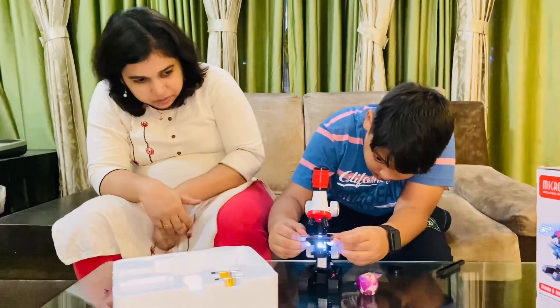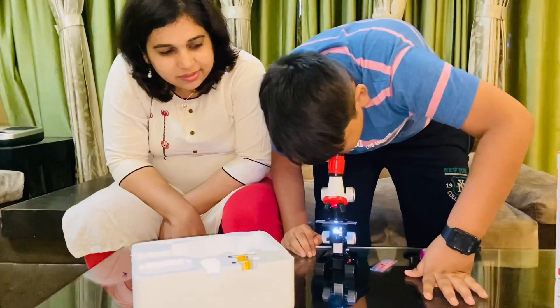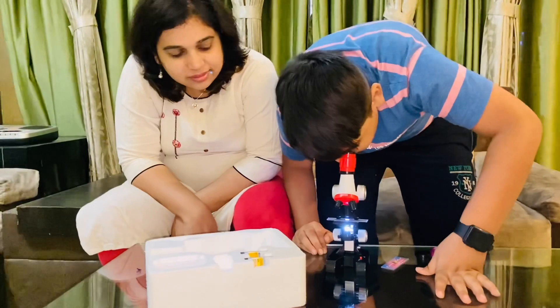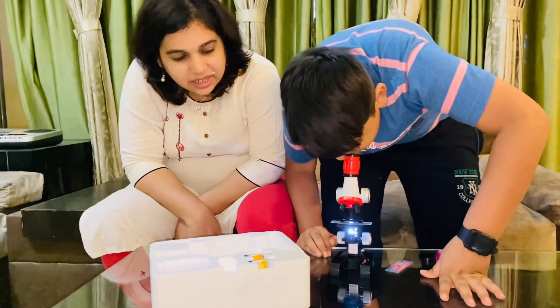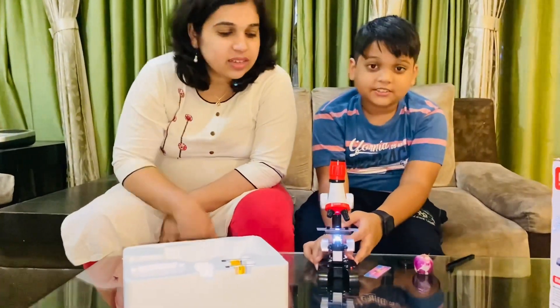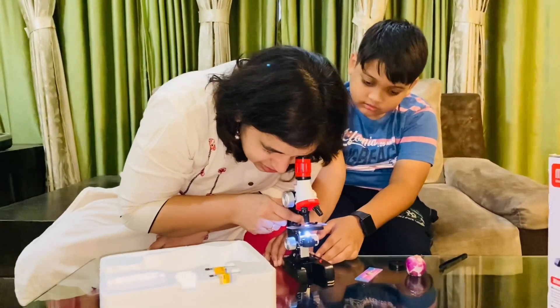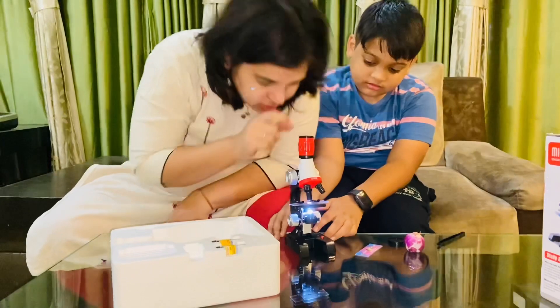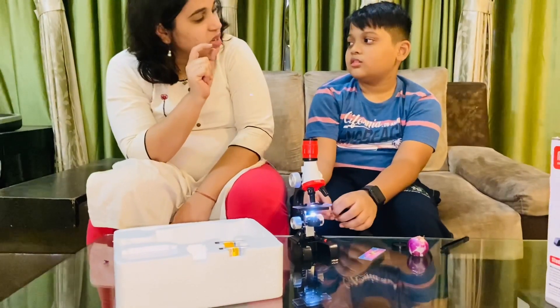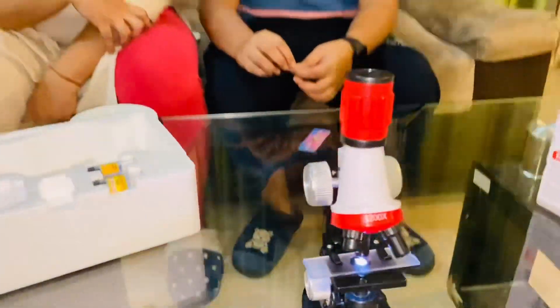Now take a look — it kind of looks like ice, like some crushed ice! Those crushed ice-like pieces are actually called the cells of the onion. You can also look through the lens to see them. That is how onion looks under the microscope.